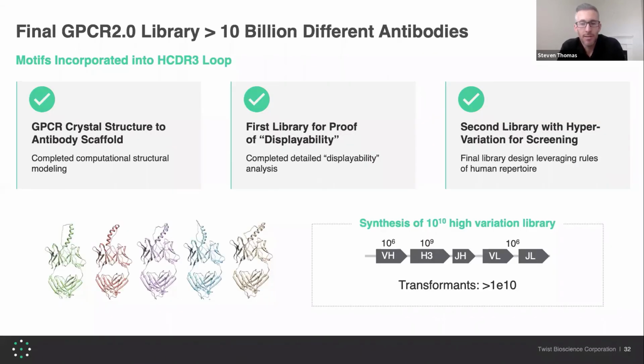But it wasn't easy. Before we could do this, we had to build an antibody scaffold that would accept all of these motifs. So we scoured our databases for all known long CDRs that we could find, and basically took out the middle and inserted the motifs that we had gathered. This was a long iterative process. We needed to figure out which CDRs and which heavy and light chain frameworks could support these grafted peptide motifs. This basically took a year.